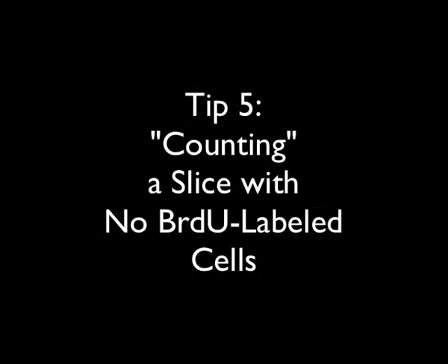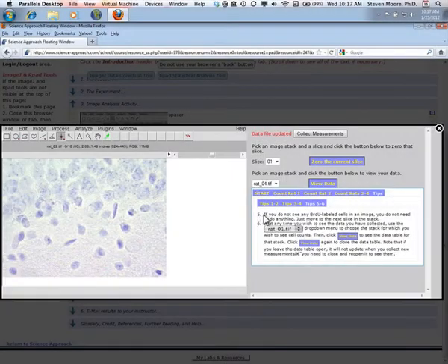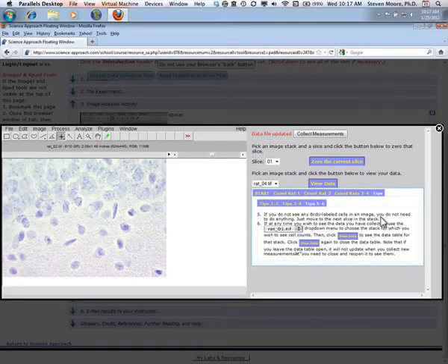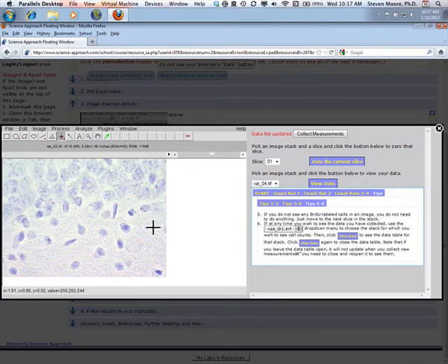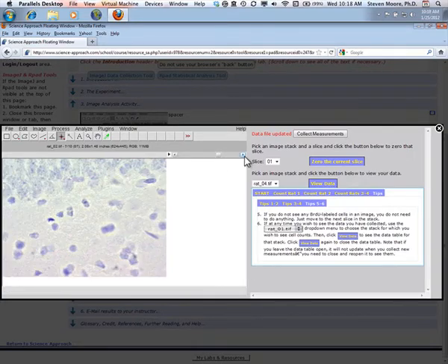When counting BRDU labeled cells, you will encounter slices that have no labeled cells. Simply move to the next slice in the stack without clicking on anything in the image.